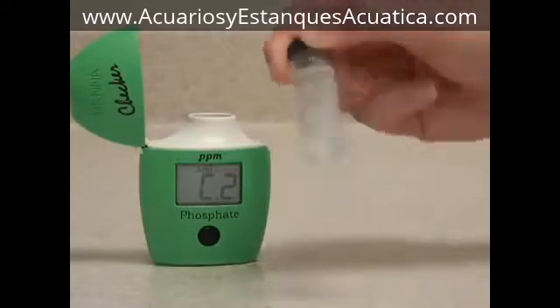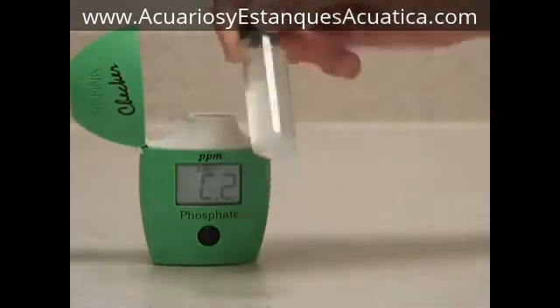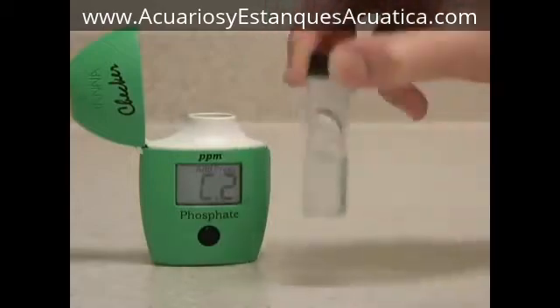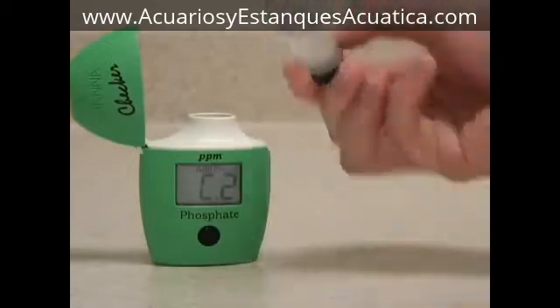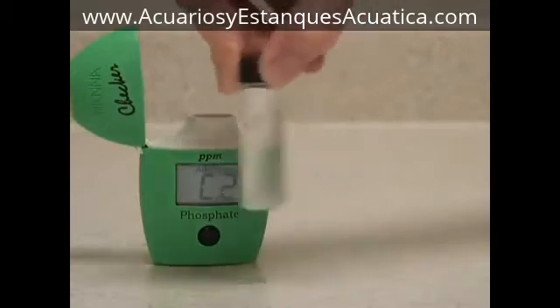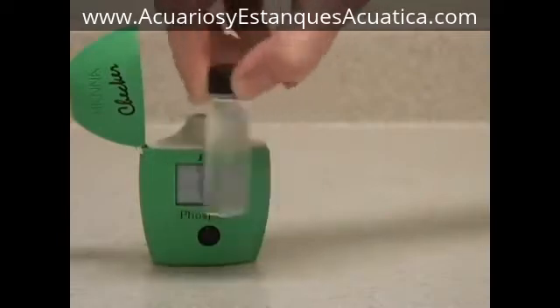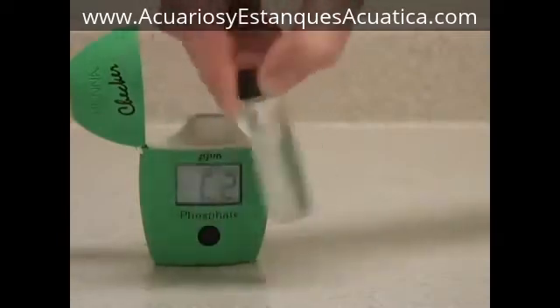The best way to do this is to swirl the vial gently like this, or invert it like this until the sample is mostly dissolved. The sample begins to turn blue as it reacts with the phosphate in the water.